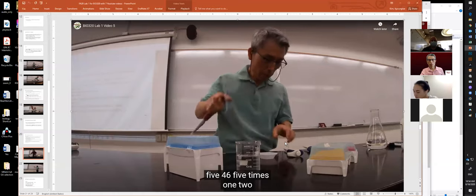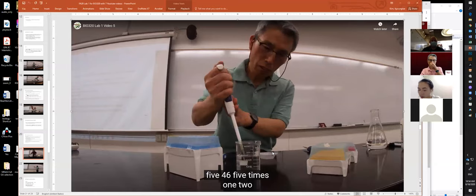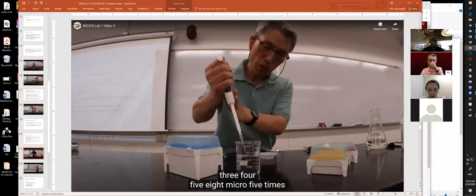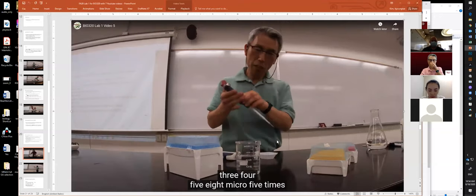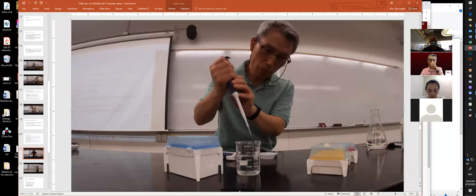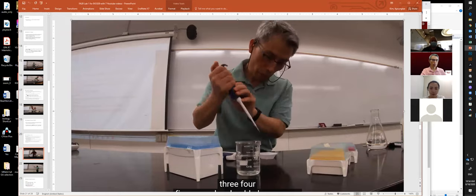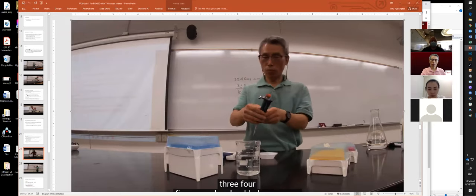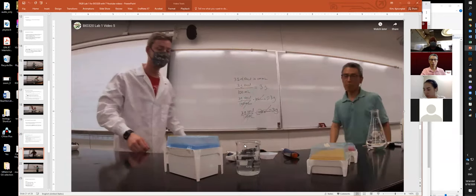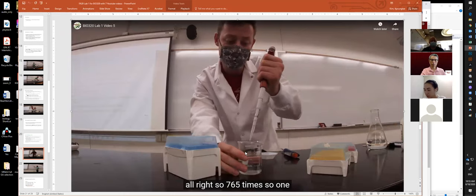1, 2, 3, 4, 5. 46 microliters. 1, 2, 3, 4, 5. 8 microliters. 1, 2, 3, 4, 5. Now push it, please come forward. Oh, we're still going, five times. All right, so 760 five times.